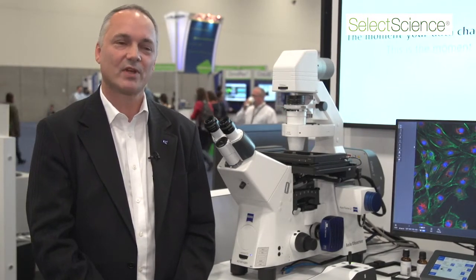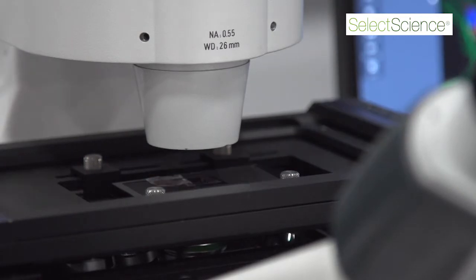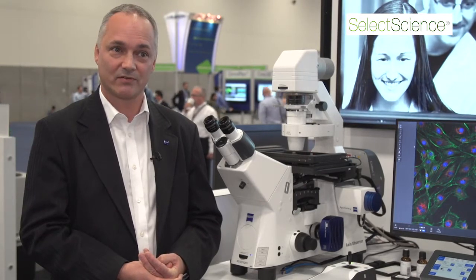The key features of the Axio Observer 7 include a number of new accessories that have been designed to enhance the performance of the microscope. Our new Calibri 7 LED illumination source is designed for fast, gentle illumination, particularly for long-term time-lapse imaging of cells.